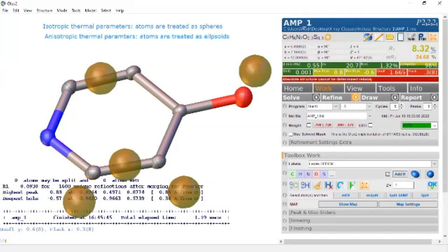So you may say, well, why does oxygen work here as well as nitrogen? And we're going to show you how you can distinguish between oxygen and nitrogen in just a moment. So right now, everything looks good. We have a lot of green. So the I over sigma, Rint is still good. Completeness, not bad. Shift is green. The GooF, we'll get to later on.